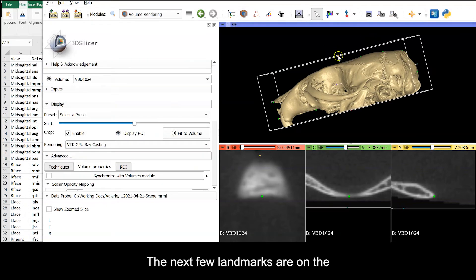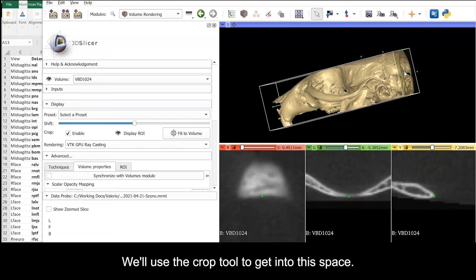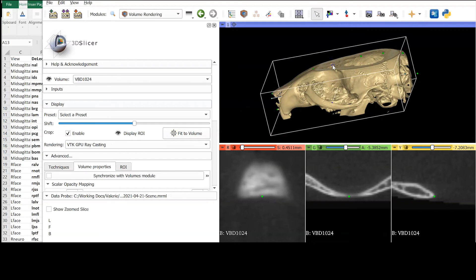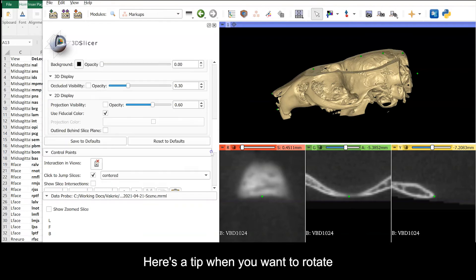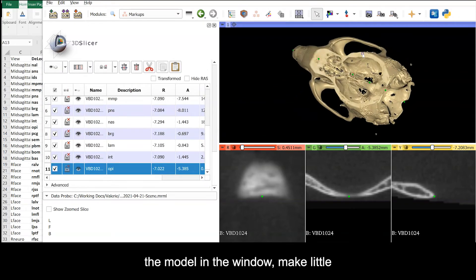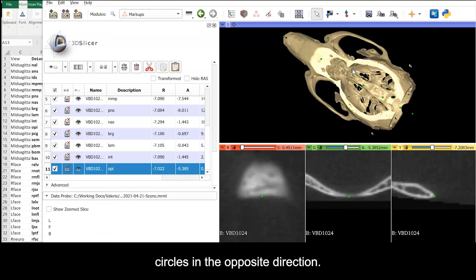The next few landmarks are on the mid-sagittal plane in the endocranial space. We'll use the crop tool to get into this space. Here's a tip. When you want to rotate the model in the window, make little circles in the opposite direction.